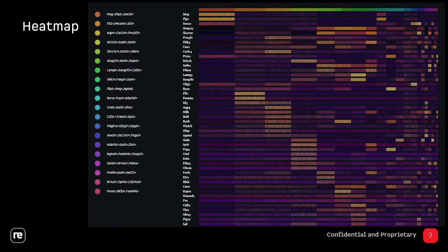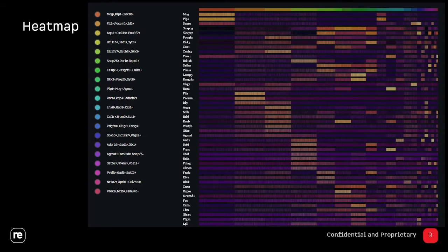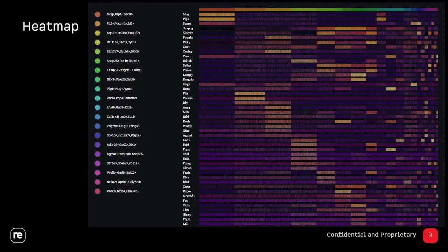The final result of the website is actually the gene by cell expression matrix where the cells are grouped by their cluster identity. We have several options to use different color schemes for the heat map so that can suit your favorite way of display high and low expressing genes.